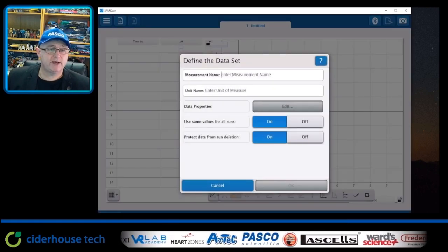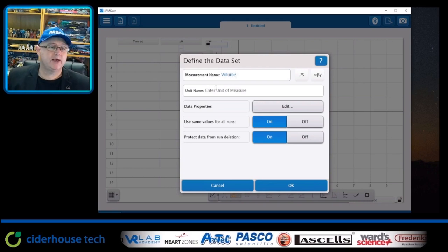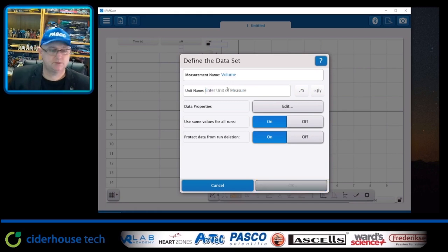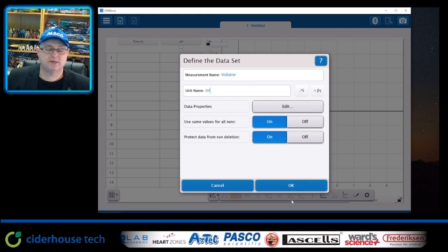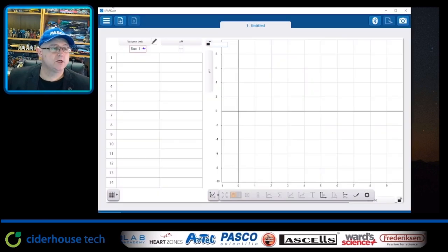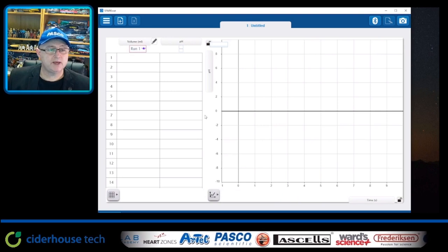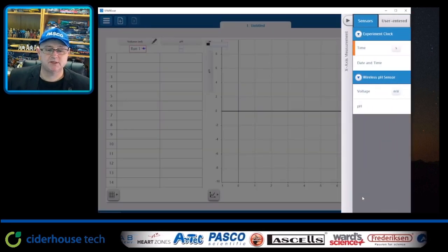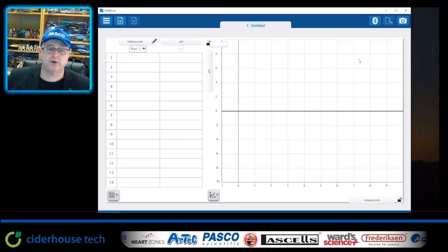I've got to give it a name, so let's just call it volume. And I'm going to measure this in mils, so ml. Okay. And I can just leave these other ones as they are. So just click OK. Now you can see it's volume and pH. When I come down the bottom here, you'll see it's pH versus time again on my graph. So I'm just going to change that to user entered and volume, which I just created. Okay. So this is now ready to go.